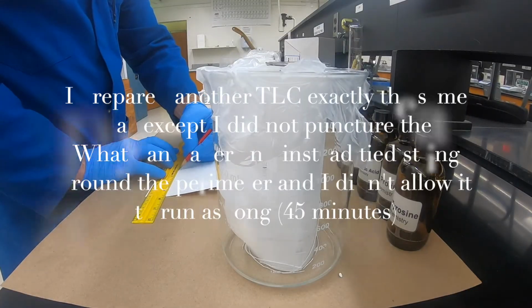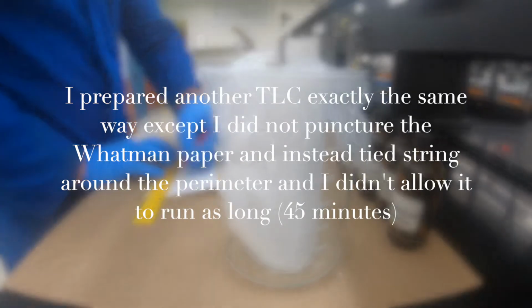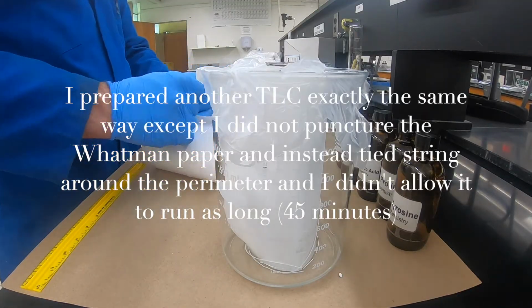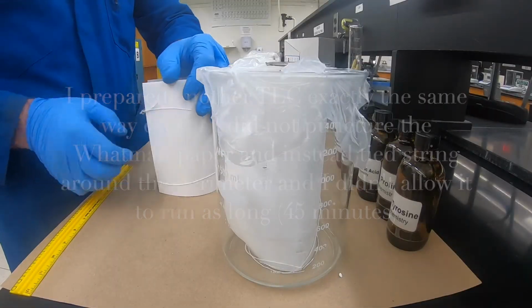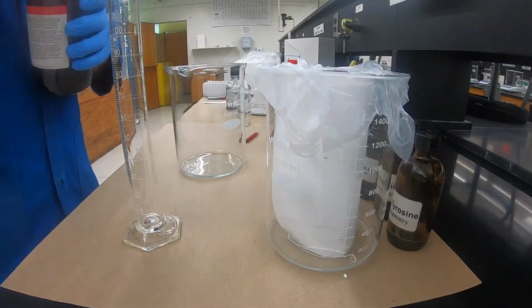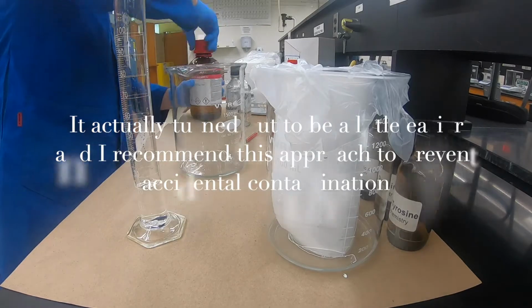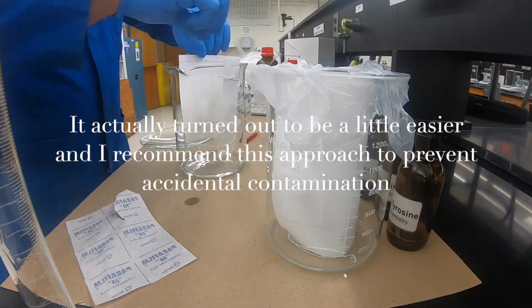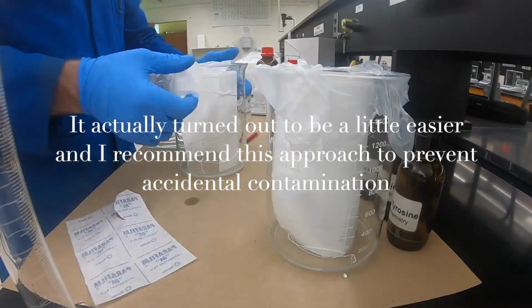I decided to also try not puncturing the TLC plate and to allow it to run for a slightly shorter time. This actually turned out really nicely, and moving around and adjusting and manipulating the TLC plate usually causes extra contamination, which this helped prevent. We'll see how it turns out.